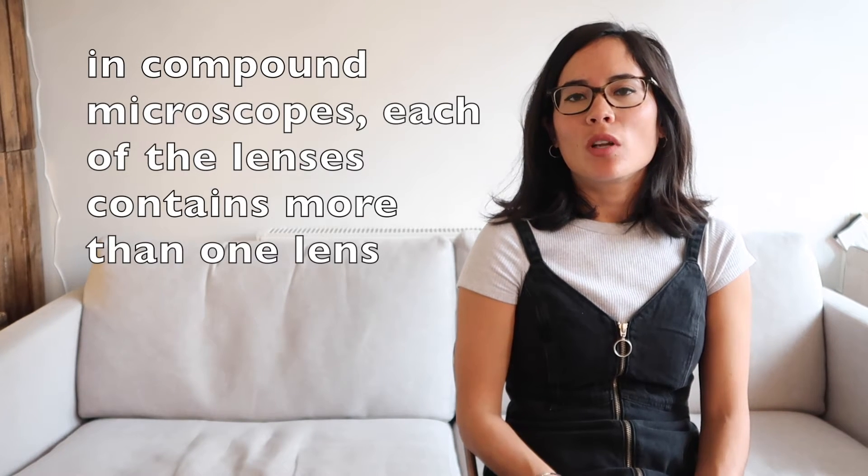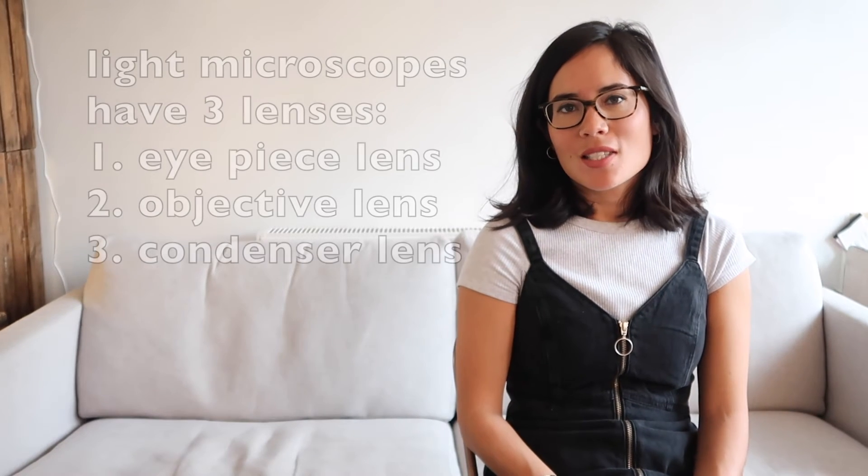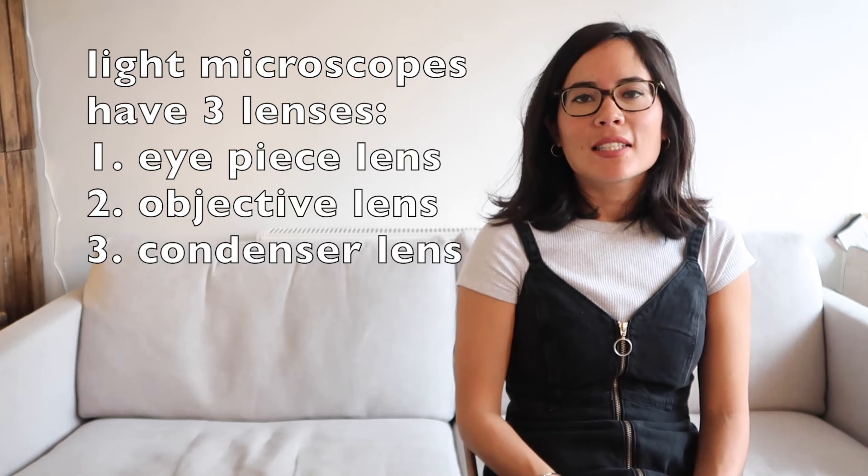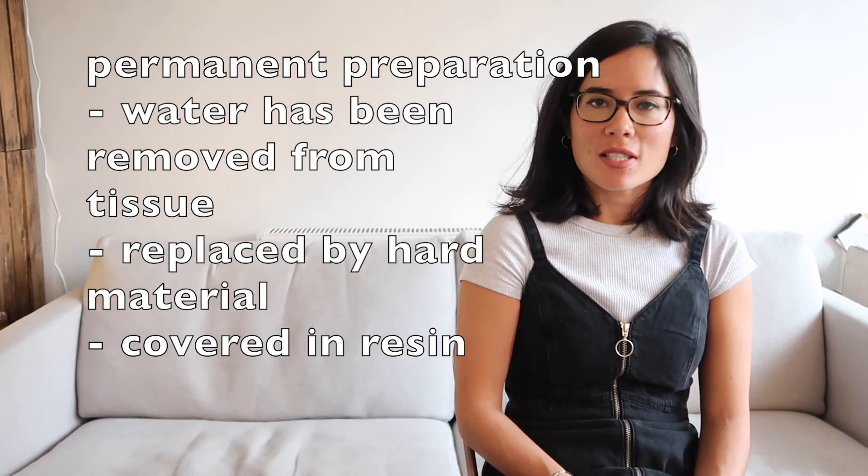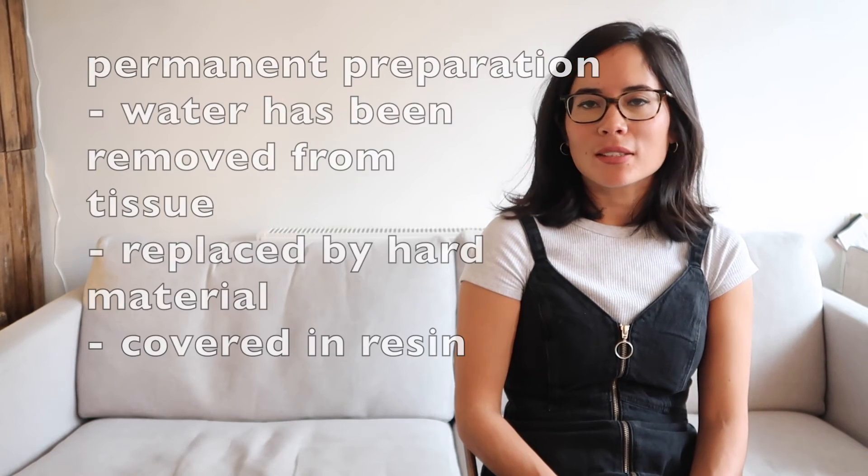Starting with the light microscope, it's called a light microscope because it uses light to view the sample. A compound microscope is another name for it because each of its lenses contains more than one lens. There are three main lenses: the eyepiece lens, the objective lens, and the condenser lens. The condenser lens focuses the light before it hits the sample. The sample needs to be very thin to enable light to pass through it. There are two types of preparation: temporary preparation and permanent preparation.